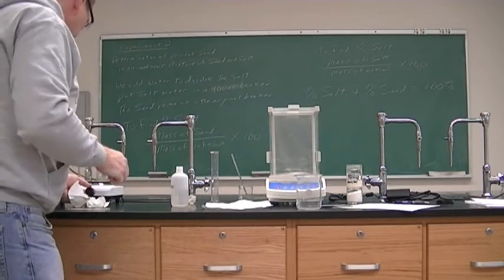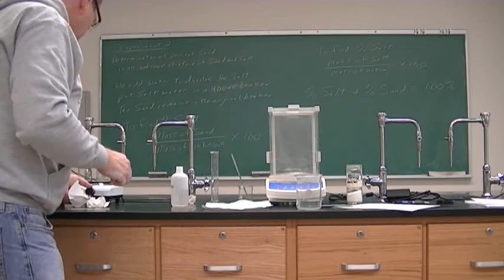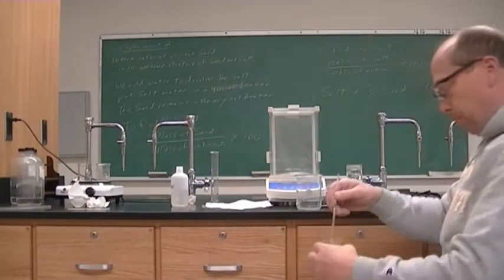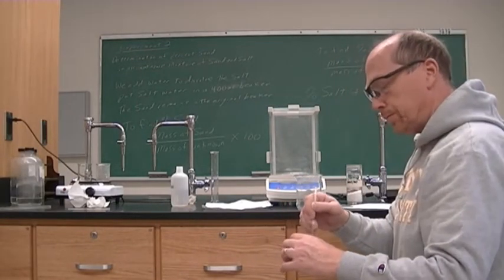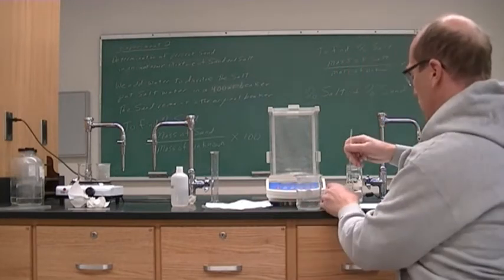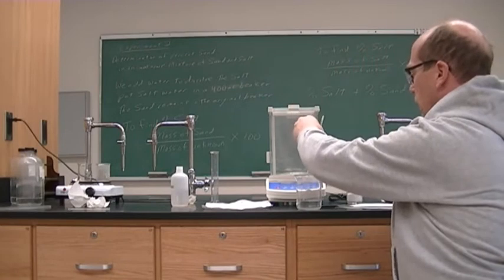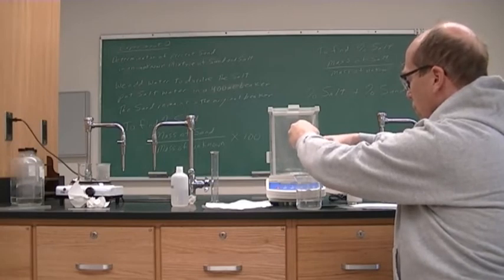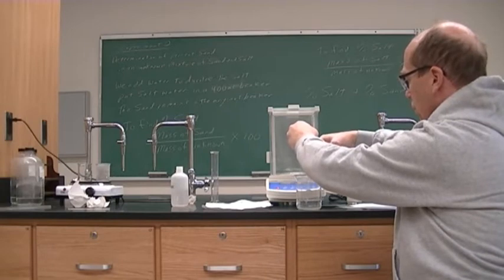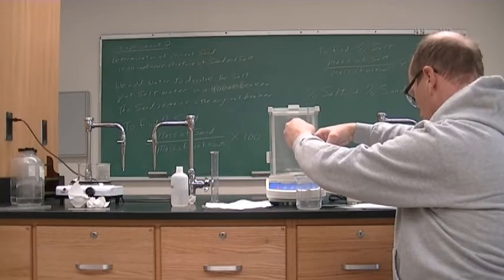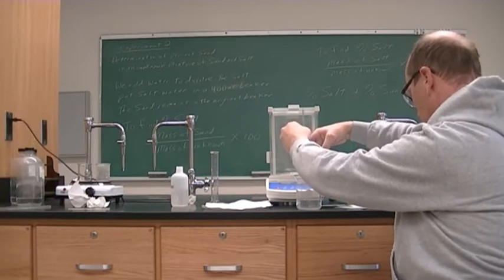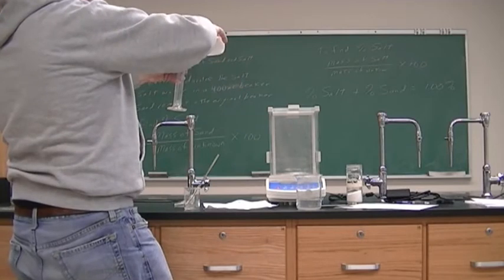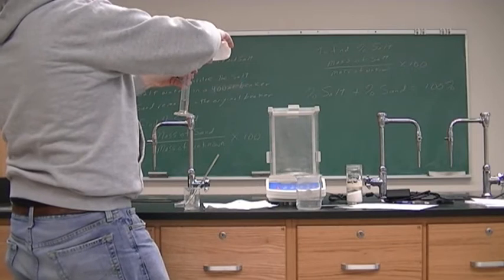The salt has dissolved, and so now we put the beaker on the hot plate. I've turned it down — hopefully there's less popping on this one, but hopefully it's warm enough to evaporate or boil out the water. Now beaker number three: the first round of 15 ml of deionized water and then decanting. Second 15 ml of deionized water.